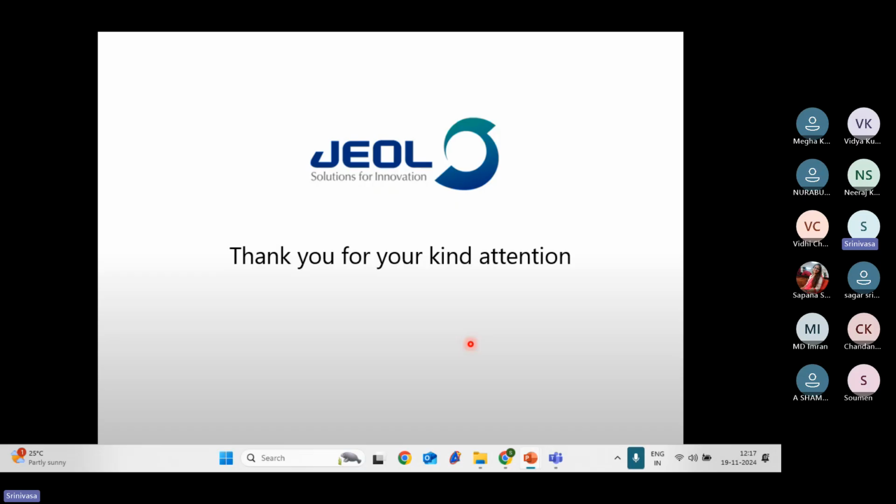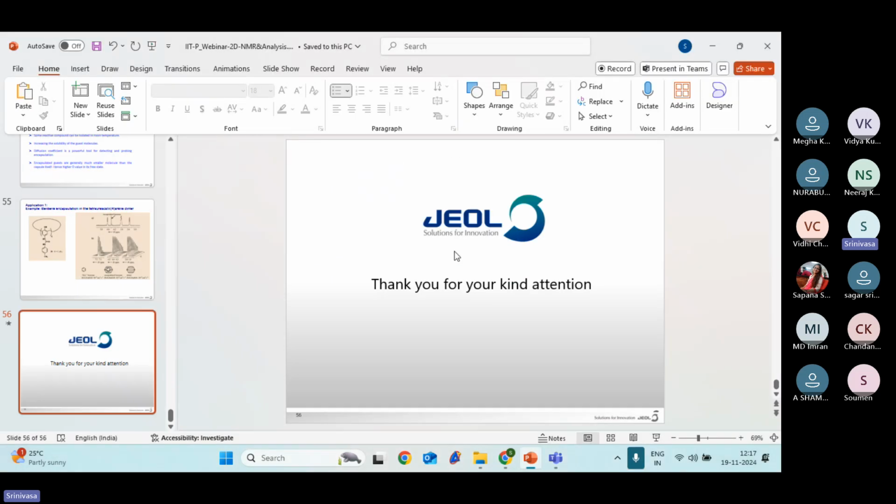So now, this is the basic introduction for today's talk. Now I'll move on to the demonstration side.